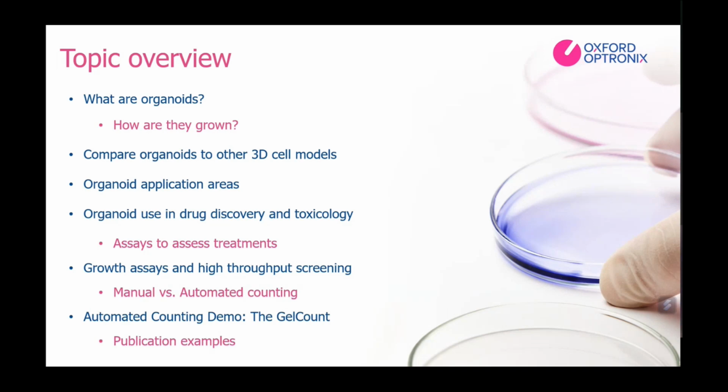Within these growth assays, we will then delve into manual versus automated counting and really look into the reasons why researchers are tending to stray away from manual counts where possible.